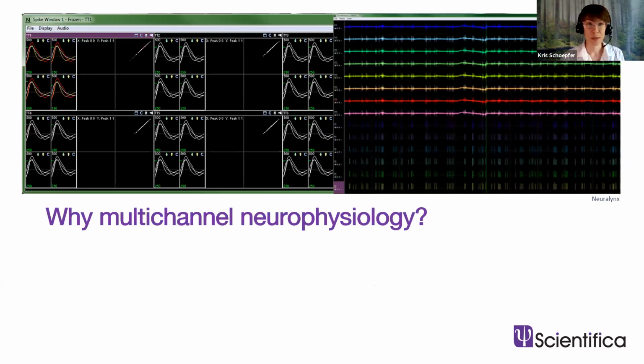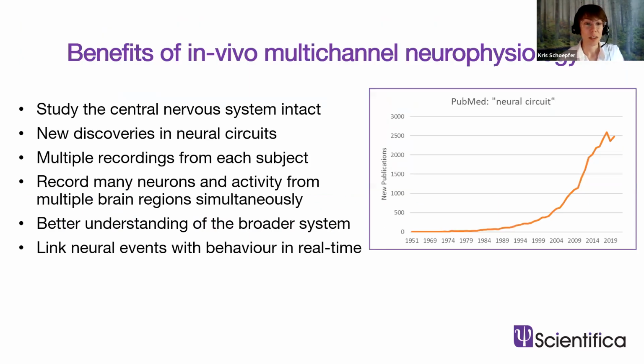So why switch from, for example, recording a single neuron, maybe a patch clamp experiment ex vivo or in slice or in culture, to something multi-channel and a little more complex?